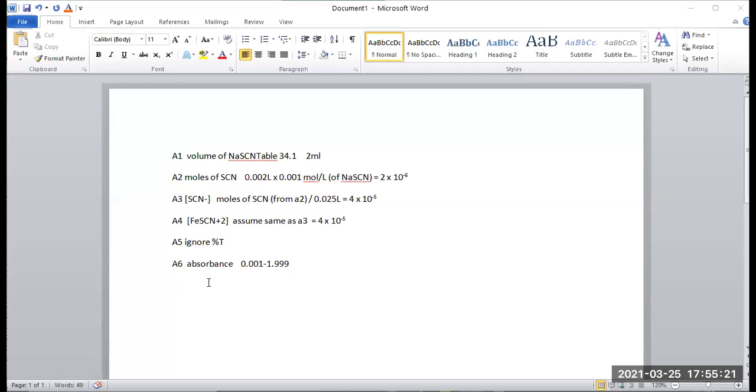All right, once you're all the way done with part A, the next thing you have are the part B bits. So by the time you've crunched all through the data for that, and you get down to B6, so you get, for instance, if your B6 absorbance was 0.252.